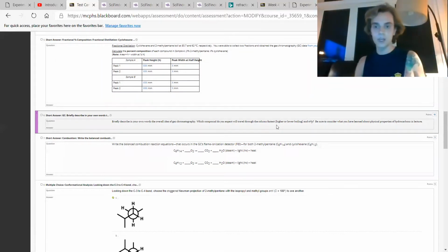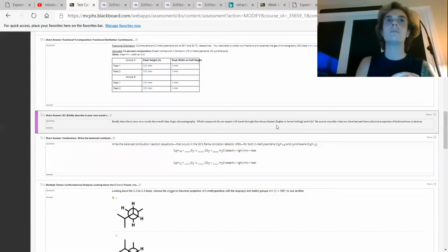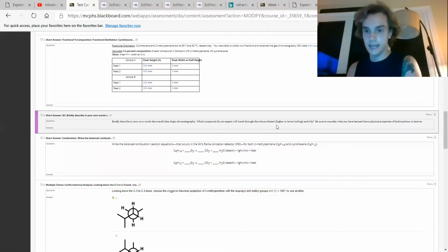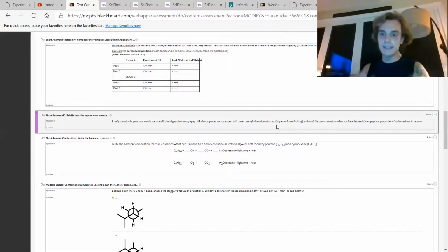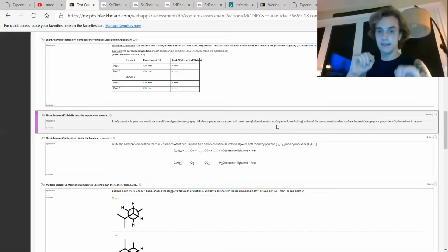All right, gas chromatography, if I can elicit you in a very brief circumstance, you are trying to separate cyclohexane from 2-methylpentane, all right? They have different boiling points, by 18 degrees Celsius. So you inject your sample, all right? It's a mixed sample of 2-methylpentane and cyclohexane, completely mixed.